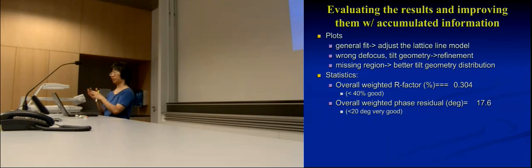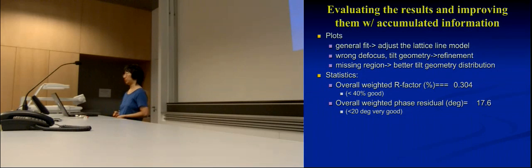It's going to increase your phase residual, and it makes your fitting generally worse. So you want to make sure you get the right defocus, and then you will get a better result. Your tilt geometry being wrong will also change the result, so that will affect the z value where your sample point will be placed.